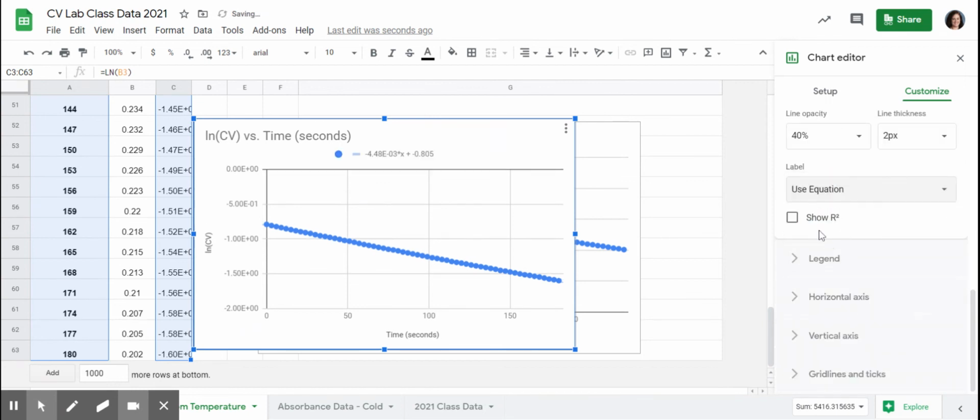and then I want it to show the trend line. I want the equation, and then you can tell it to show r squared if you want just to check like how close it is to actually being a straight line. Ours is 0.999, which is super straight, or matches the data, correlates really well. So this is the equation of my line.